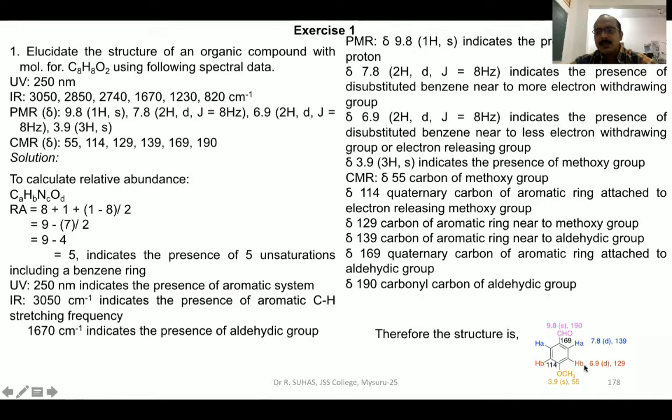Here you are supposed to explain both proton NMR as well as C13 NMR. That is the difference from the previous composite problems to today's composite problem. In the previous composite problems, we were discussing only the proton NMR in the structure, whereas because C13 NMR is also given in today's session, you have to discuss C13 NMR values also in the compound. So for that reason, we have to write the structure first and then assign all the protons first.